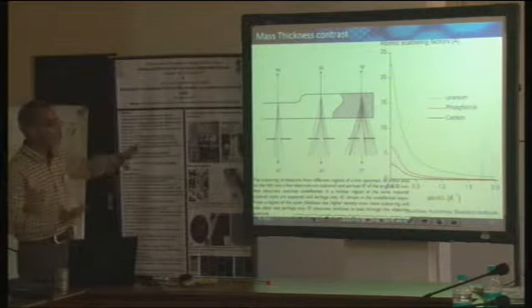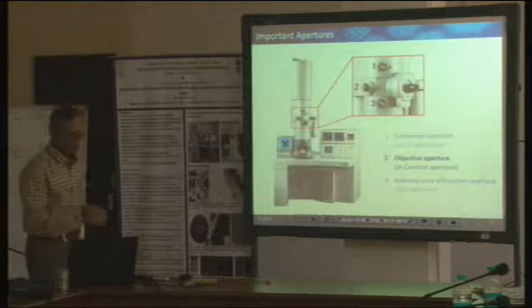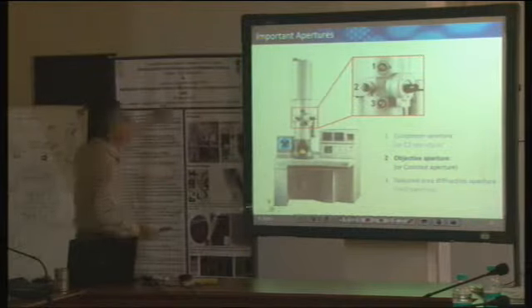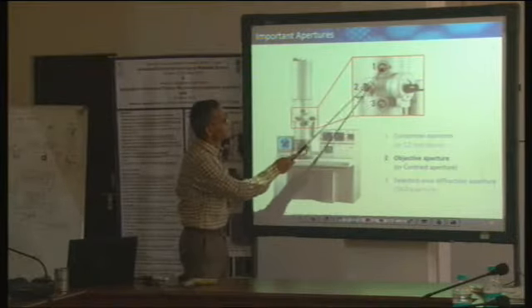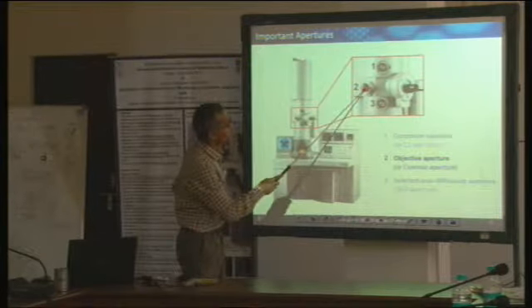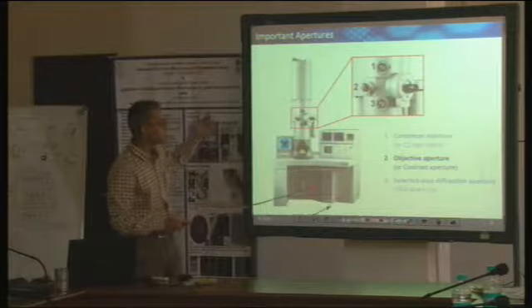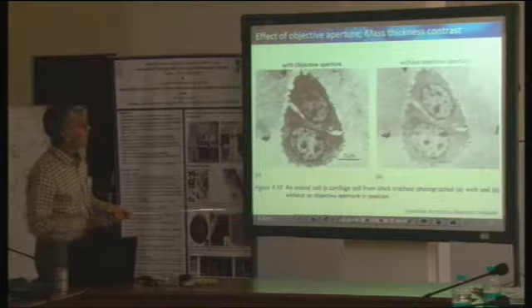I think we can more or less close here. We will probably talk about some examples. And this is just a repetition. So far we were only drawing schematics. This is the condenser aperture and lens, here is the sample which we put in, this is the objective aperture, and this is the first intermediate image plane. These are the things we have used to schematically discuss the whole thing so far, and that's shown here. Good.